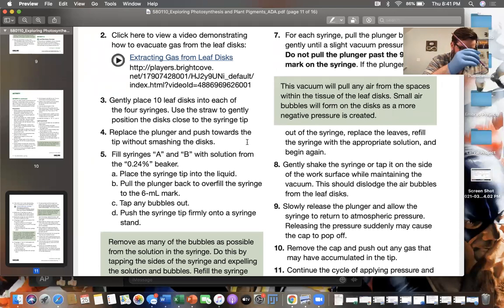If the thing gets stuck within the straw, you can just blow it out. It's 4. This might seem tedious, but it's not too challenging.